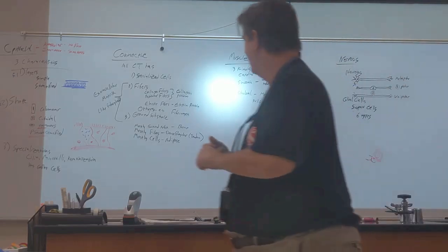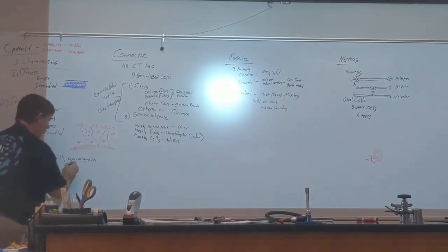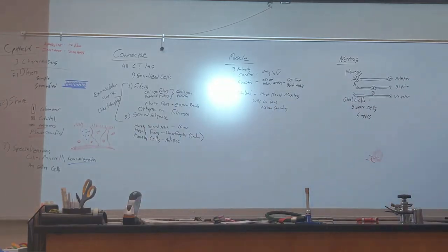So if we say that a cell is keratinized or has undergone keratinization, that means that it is full of a tough protein and it makes it hard to destroy that cell. Good? Now, an example of that we already talked about. I'm going back to your lab manual.